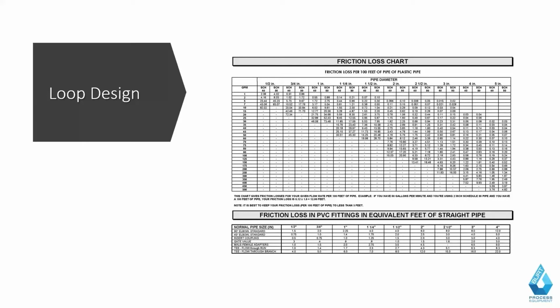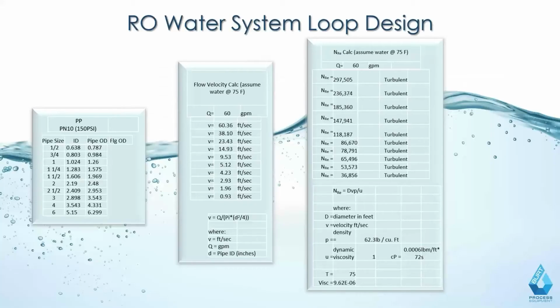They used to kind of be the old norm that, hey, I want to maintain like 3 to 5 feet per second to knock off bacteria. That's not really true per se. What you're really just trying to do when you're doing a loop design calc, taking the friction loss for the piping and the valves, etc., is figure out how much turbulence do I have?